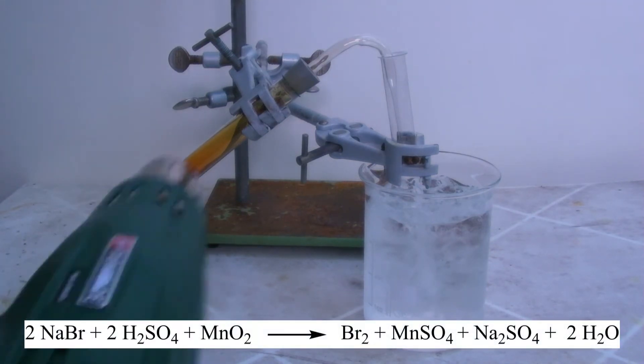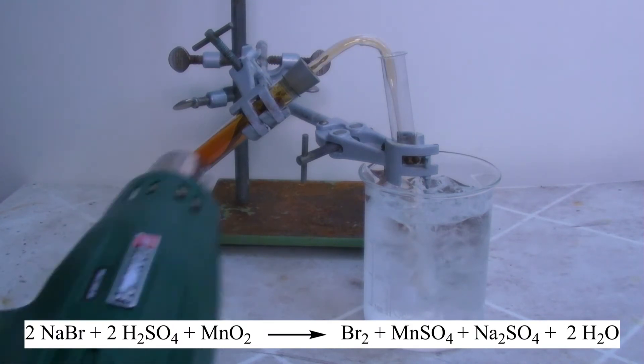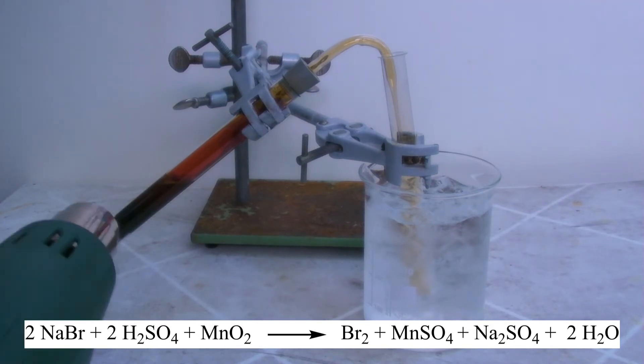The mixture of manganese dioxide and sulfuric acid oxidizes the bromide to bromine. Manganese sulfate, sodium sulfate, and water are formed. With this reaction, iodine and chlorine could also be prepared from iodide or chloride salts.